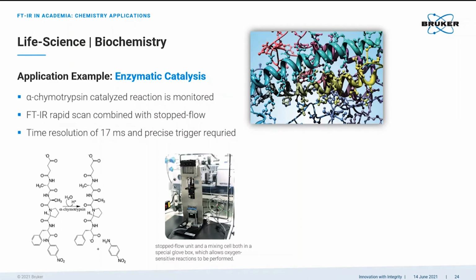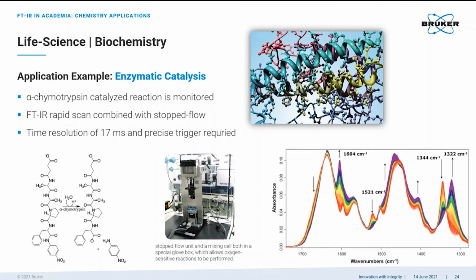The result is presented here. The formation of the product can be followed by the increase of the two absorption bands at 1604 and 1322 wave number and the decrease at 1344 wave number, indicating the formation of a new C-terminated carboxylate group.